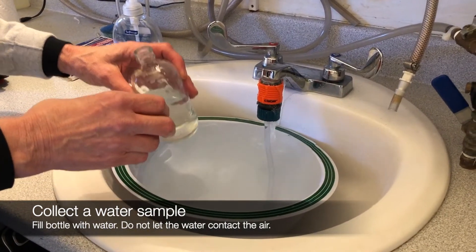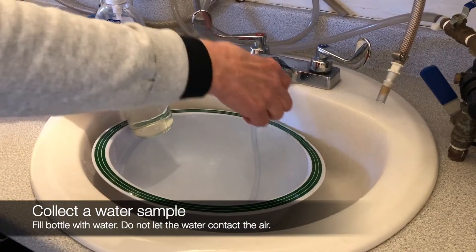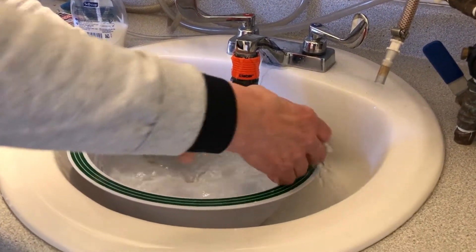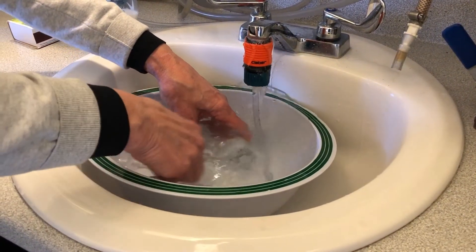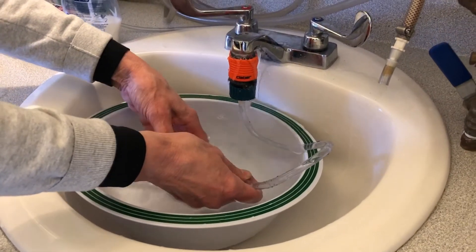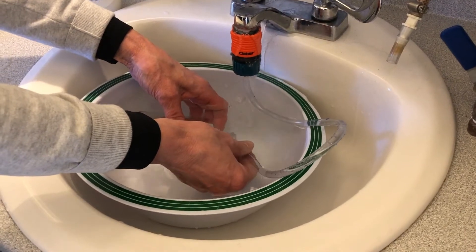It's important to get a good water sample, so for that you want water that hasn't been aerated. Use the faucet adapter that comes with your H2O, fill up a bowl or a bucket of water, submerge your bottle, and put the tube into the bottle so that you can fill up the bottle with water that has not been aerated.